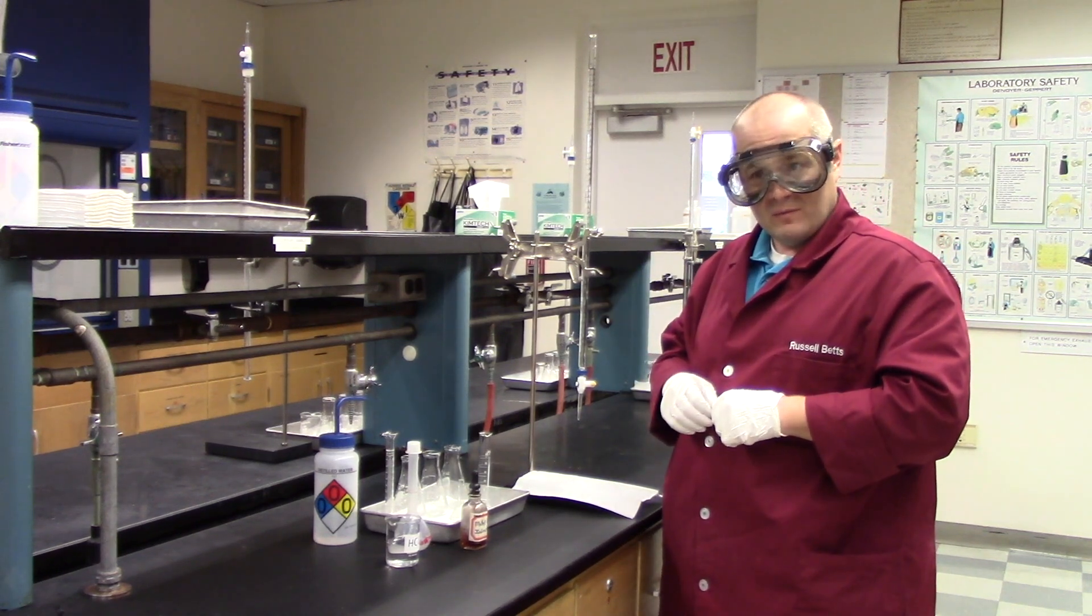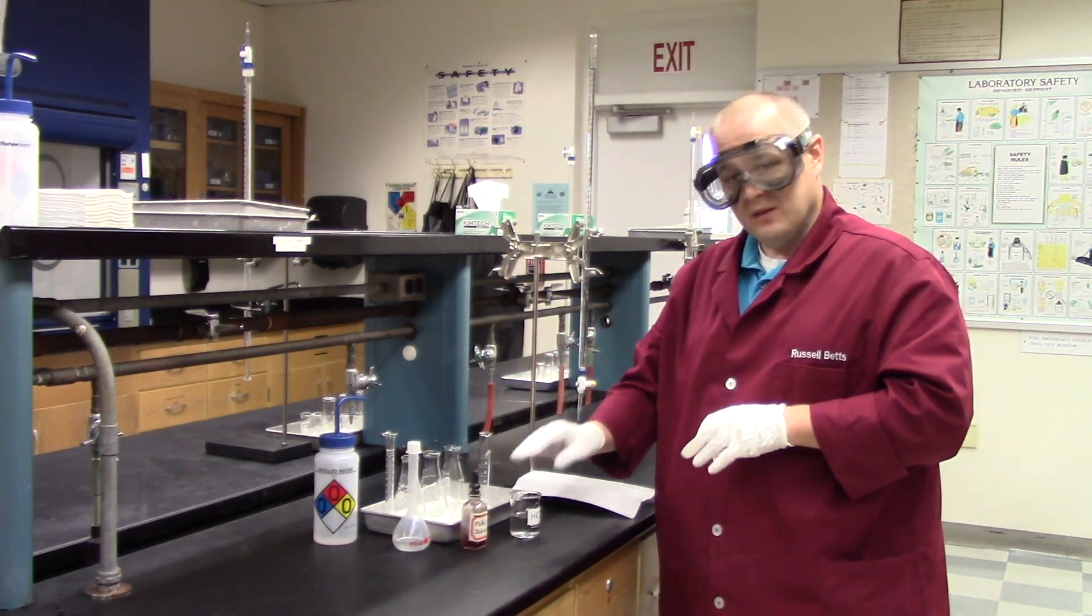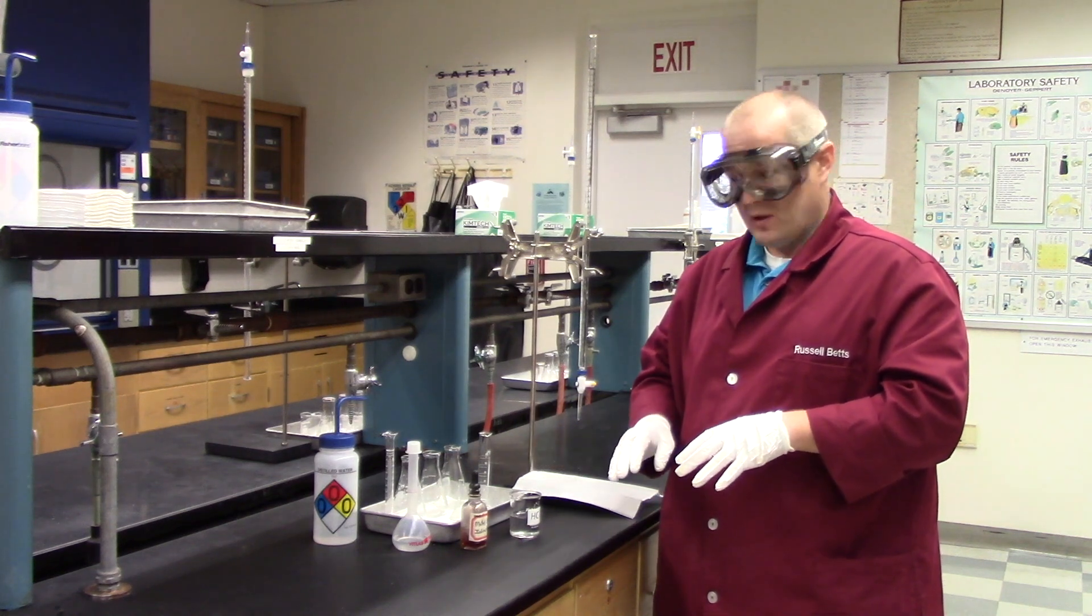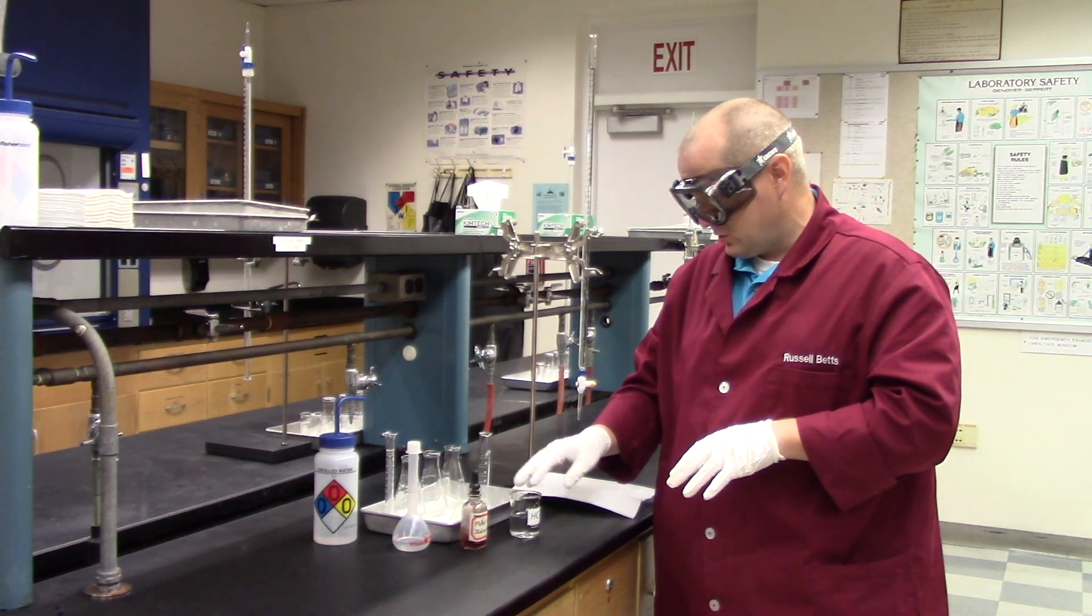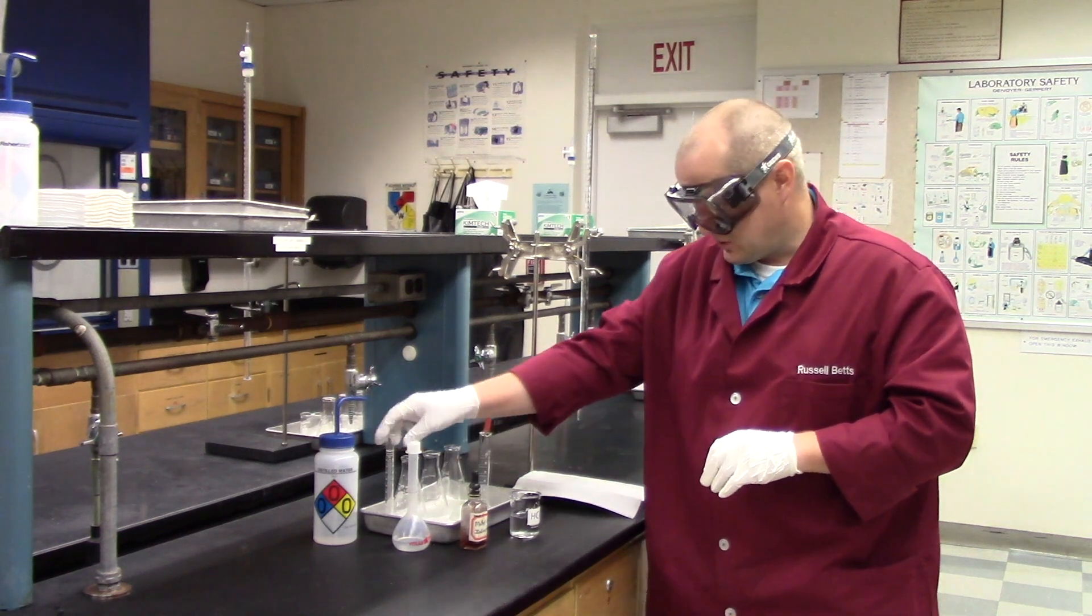Now we have to make our acid solutions. Here I have the acid in this little beaker. It's in the fume hood. We have the concentration of this acid written down in our notebook. Now we need to transfer 10 milliliters of this solution into each of these Erlenmeyer flasks. So let's do that now.